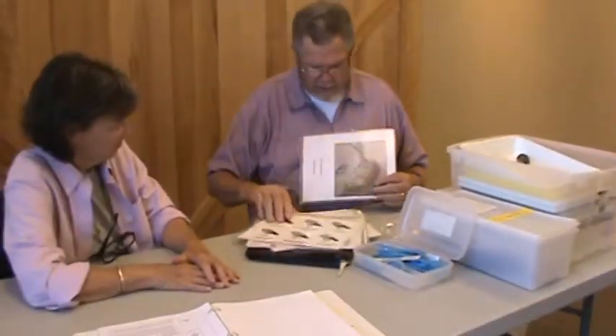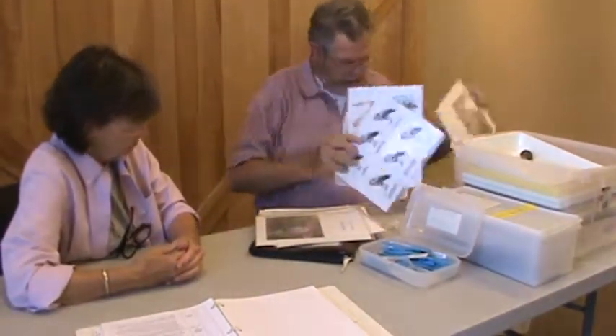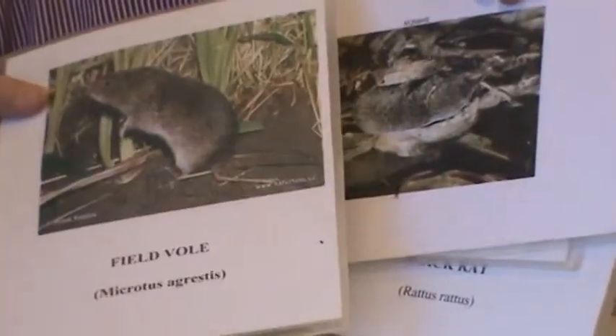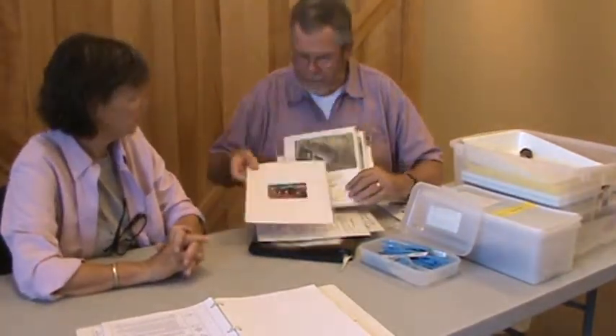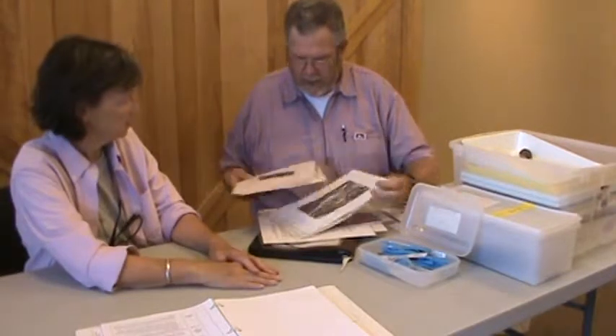There are pictures of the rat, mouse, shrew, vole, and mole. The vole is so common, I call them owl candy. I don't show these pictures as part of the lecture — if during a dissection you come across a vole, I'll get the picture and show it then. That way they've got something to connect to, and it's more interesting. Otherwise it's a little boring to just listen to me talk about it.